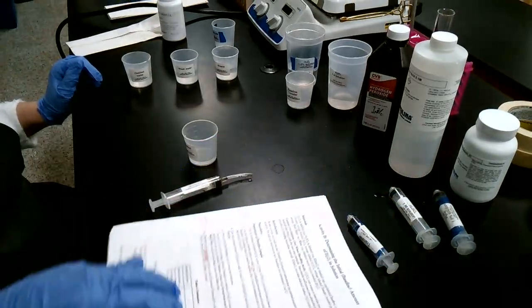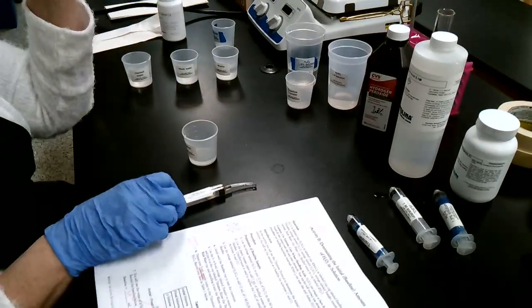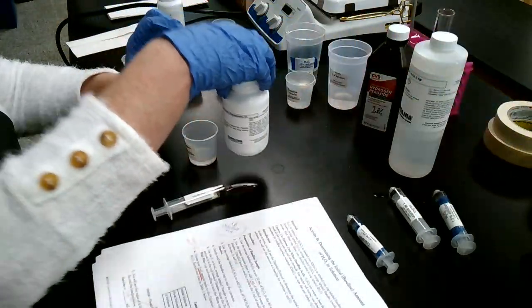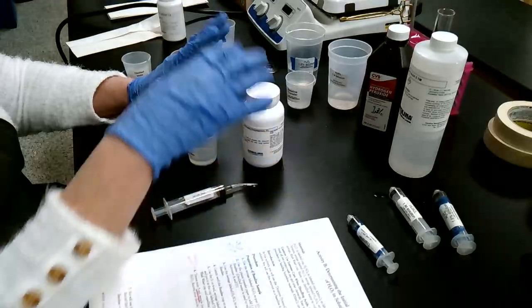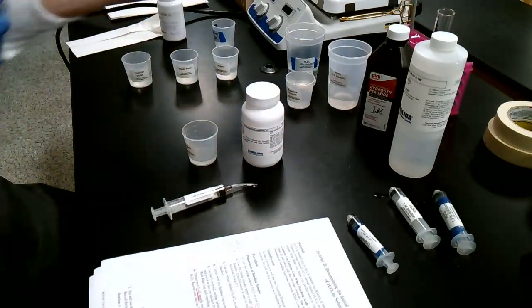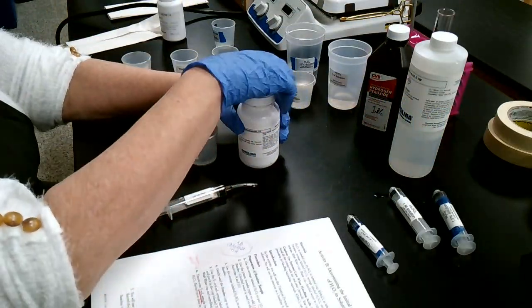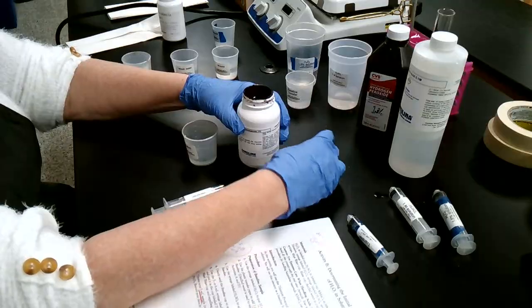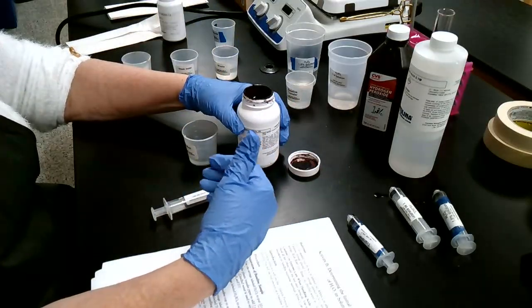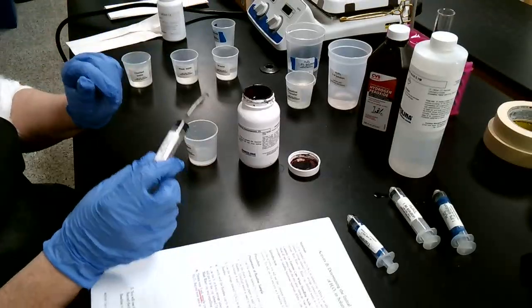So now I'm ready to titrate. I'm going to get my titration syringe, the one with the little hose on the end, and I'm getting my potassium permanganate. This stuff can really stain. I know I'm wearing a white sweater. I don't know what I was thinking. I'll pull up my sleeves a little bit more. But you can open it up and take this right out of the container. It's kind of hard to contaminate this stuff. But anyway, we can get it right out of here.